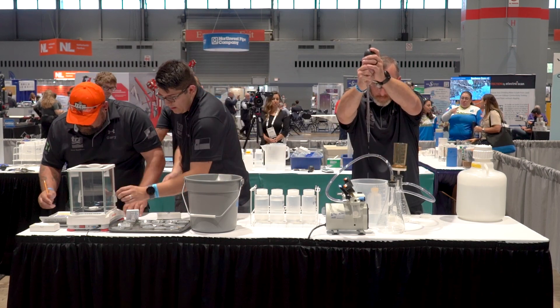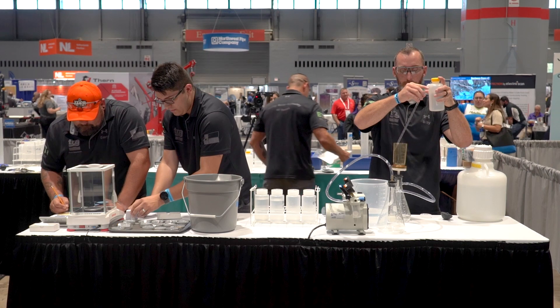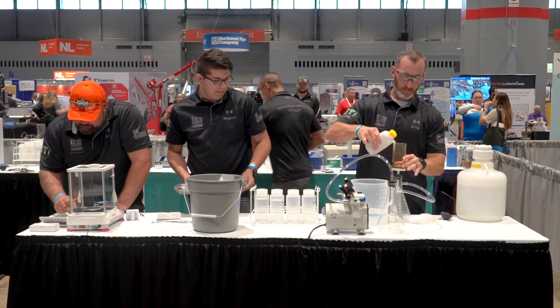The lab is obviously a timed event, but procedure is also very important — the penalties are big. We want you to learn how to have proper lab technique. Even though this is a competition, it's very important to follow proper lab technique when possible.